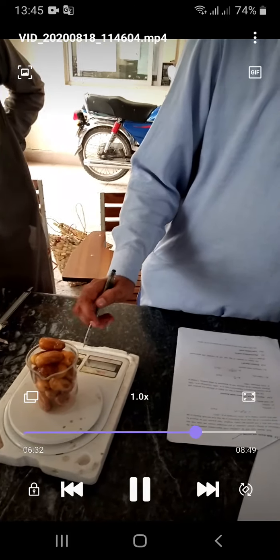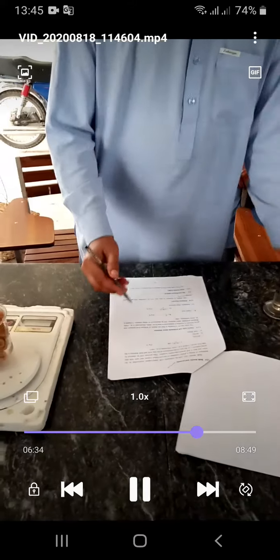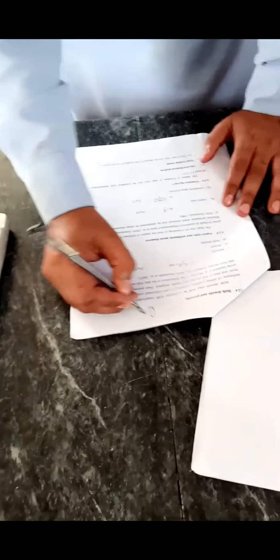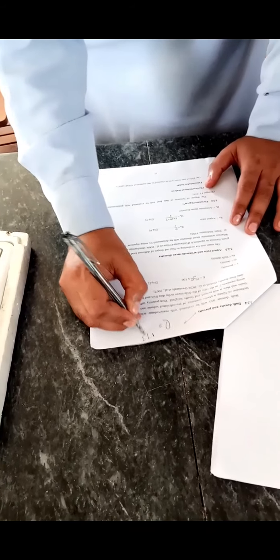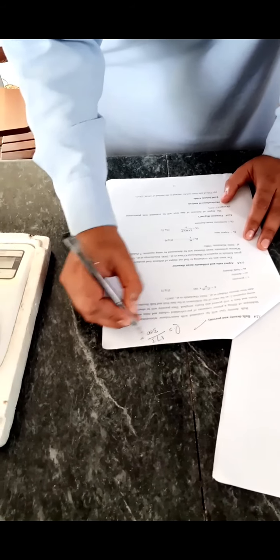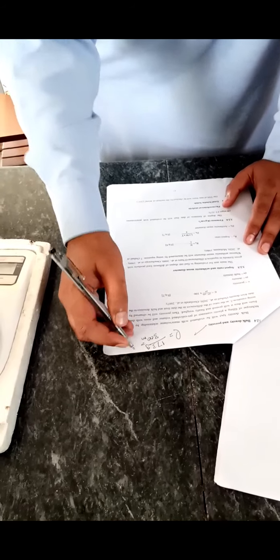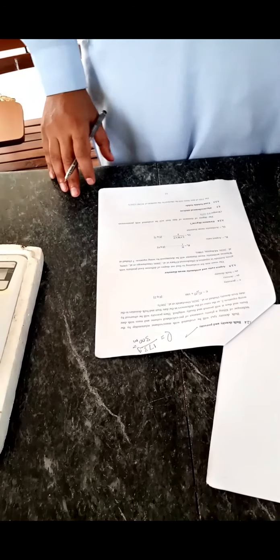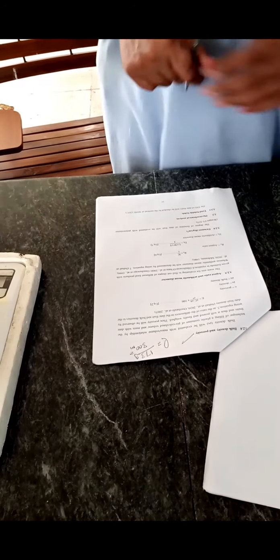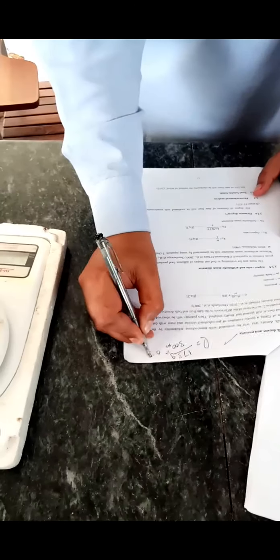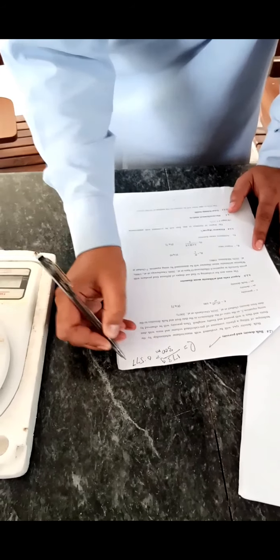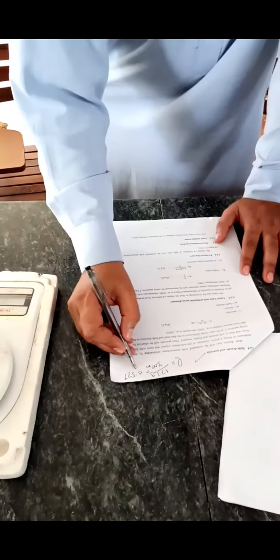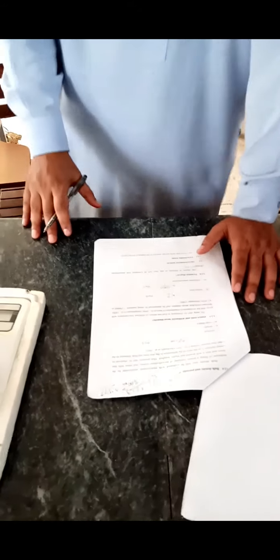Now we will find the bulk density. Bulk density is again mass per unit volume. The mass will be recorded and the volume was 300 ml. So the mass is 173 divided by 300, which gives us 0.57 — that is the bulk density of the dates.